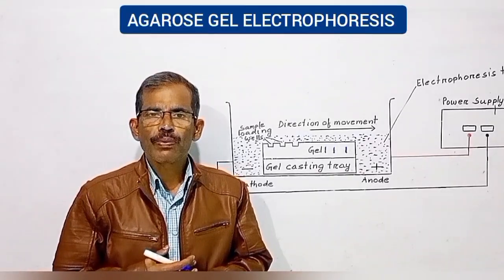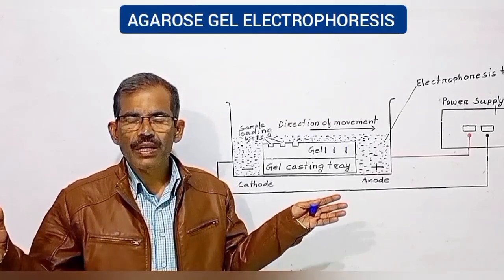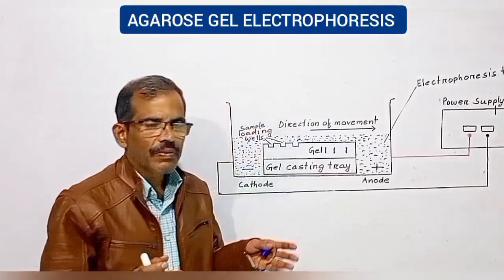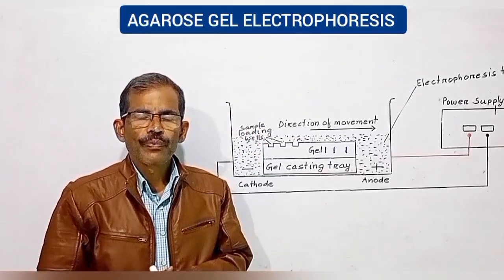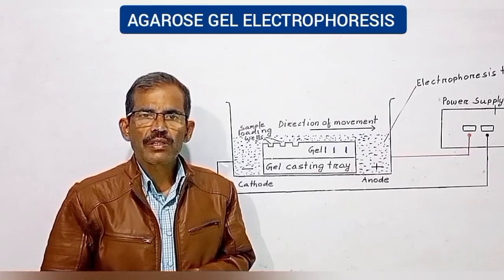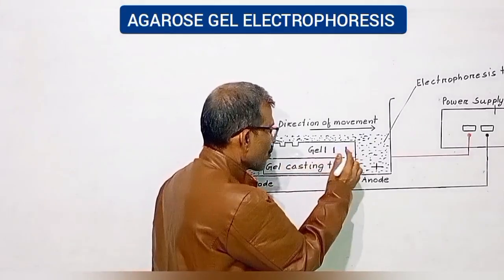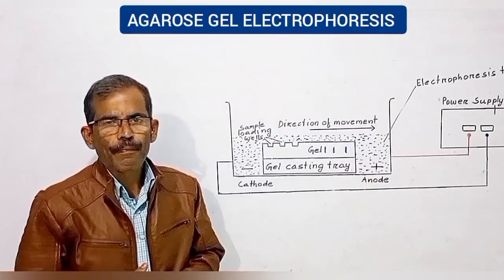During the course of electrophoresis, the tracking dye moves at the fastest speed along the gel, leaving the smallest DNA fragment behind. Electrophoresis is usually stopped when the tracking dye front has reached the opposite end of the gel.